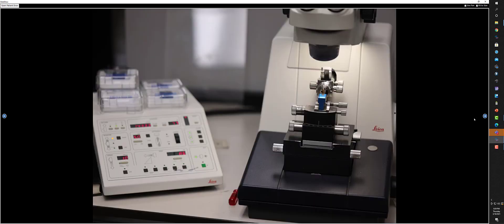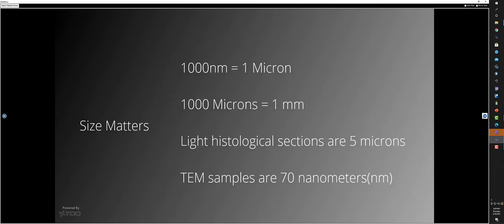After you have it faced, you take it to the ultramicrotome, place a diamond knife, and place the specimen in this chuck here. The microtome is controlled by this control panel. Now just to review some sizes: 1,000 nanometers equal 1 micron, 1,000 microns equals 1 millimeter. The sections we use are about 70 nanometers thick. Our survey sections will be anywhere from 500 nanometers to 300 nanometers, still way less than your typical histological light microscope sections.